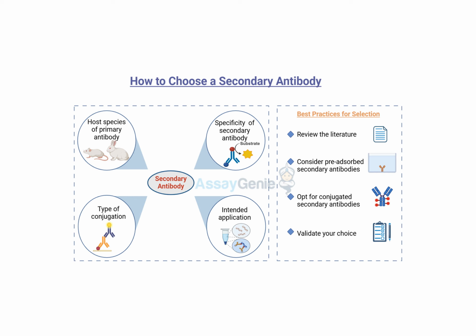It's not just about seeing something, it's about getting reliable data, making sure your results are actually accurate. I've seen really, really well-designed experiments just totally go off the rail because of a poor antibody choice. It's kind of heartbreaking when that happens.